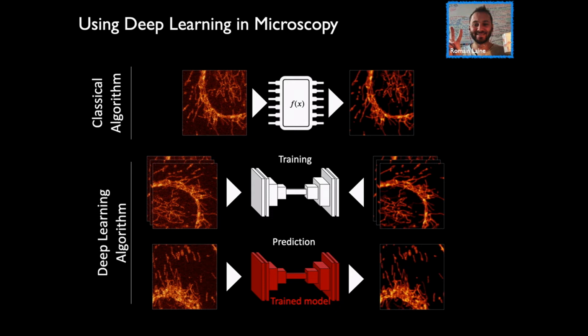Here's the beauty of it. Here's what gets me awake at night, which is what I'm showing you. The neural network knows nothing about denoising. I gave it no conception of what the physical principles behind denoising are. The only thing the neural network is doing is trying to its best capacity to transform the image that exists on the left to the image that exists on the right.